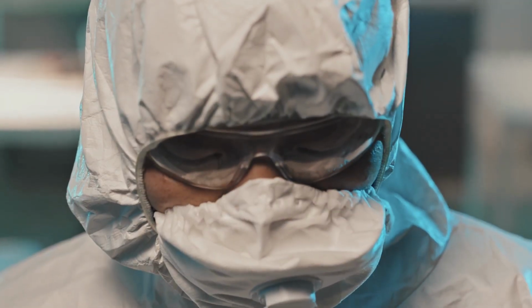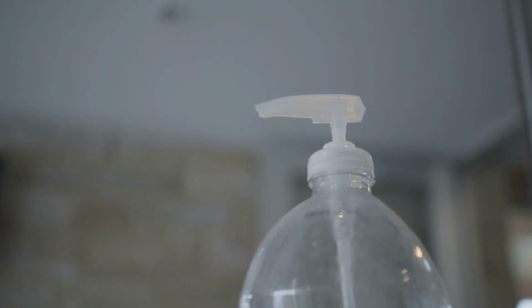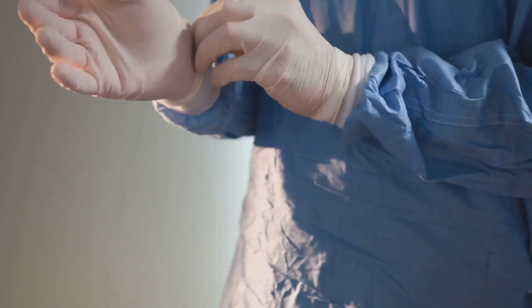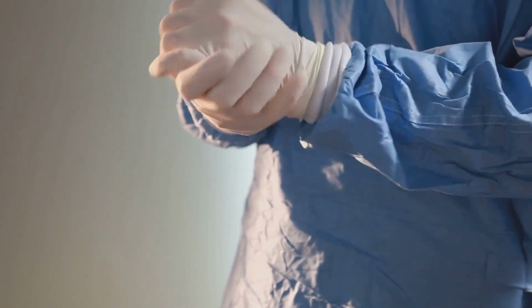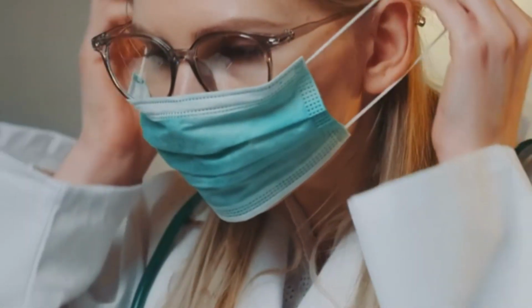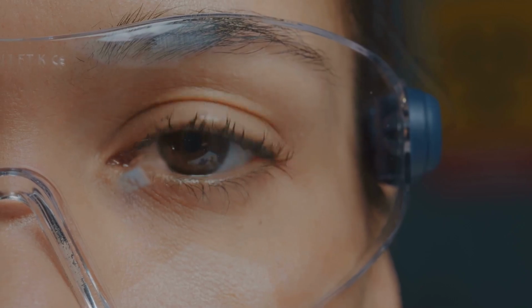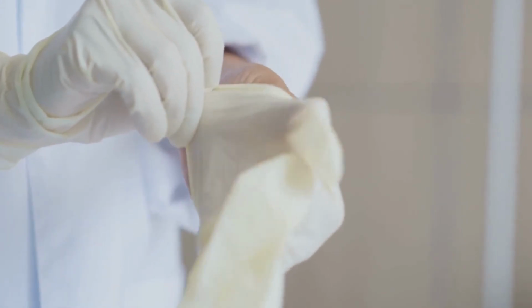Putting on PPE, donning. Begin by washing your hands thoroughly with soap and water, or using an approved hand sanitizer. Put on the gown first, if required. Tie it securely so that it covers your clothing and skin. Next, put on your mask or respirator. Ensure a snug fit around your nose and mouth. Place goggles or a face shield on last to protect your eyes. Finally, put on gloves. They should extend over the wrists of your gown if you are wearing one.